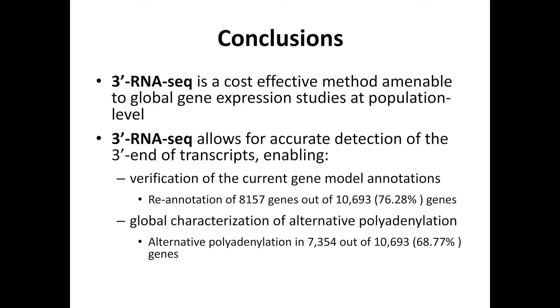People would be interested in looking at association between variation in polyadenylation and phenotype. Because sometimes transcripts with different lengths do different jobs, or have different lifespans. So it would be interesting. People can study this type of polyadenylation using a technology that is not very expensive.